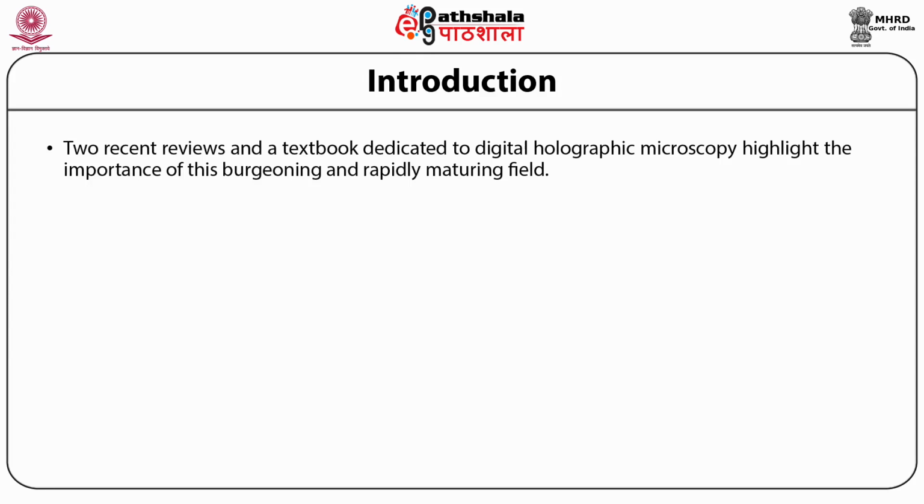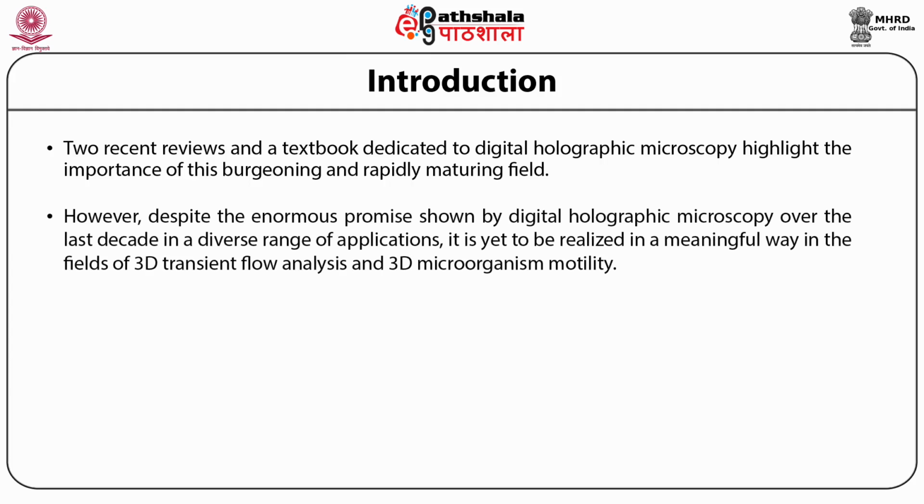Two recent reviews and a textbook dedicated to digital holographic microscopy highlight the importance of this burgeoning and rapidly maturing field. However, despite the enormous promise shown by digital holographic microscopy over the last decade in a diverse range of applications, it is yet to be realized in a meaningful way in the fields of 3D transient flow analysis and 3D microorganism motility.